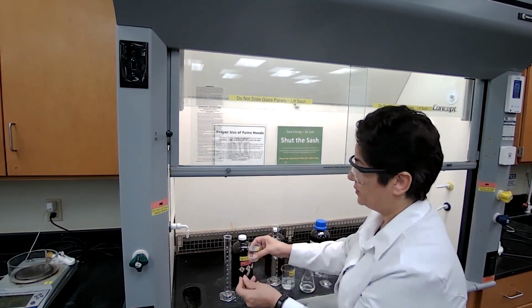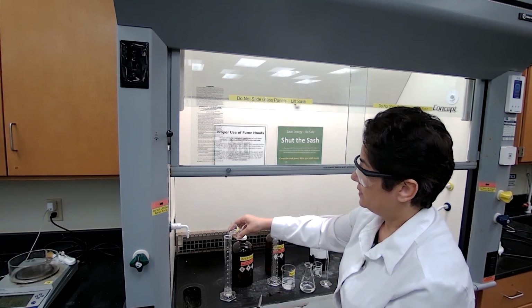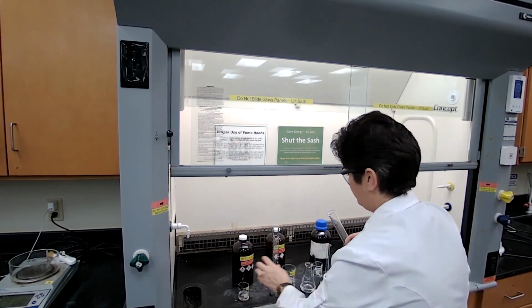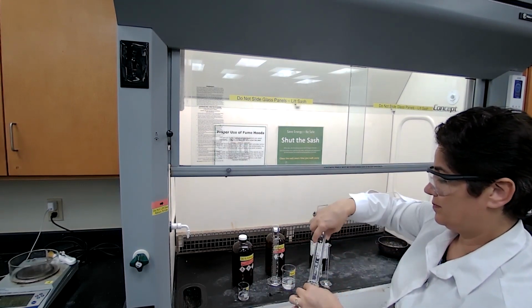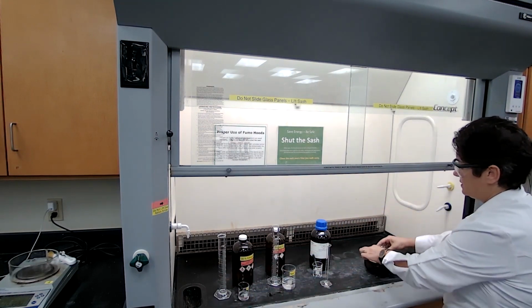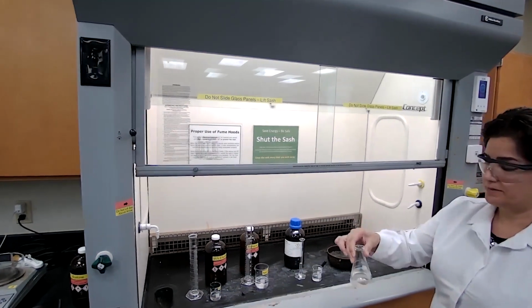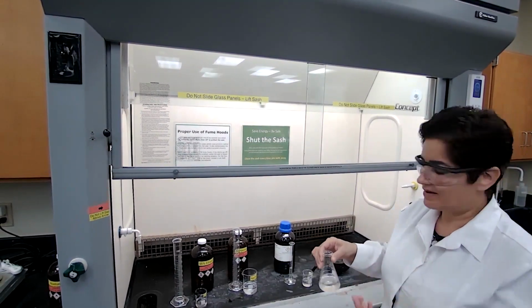This is the procedure, so you could look at the numbers in the procedure. Place this in the ice bath for 3 minutes. We have the mixture in the ice bath for 3 minutes to cool down, so when we are adding acetone, it doesn't evaporate right away.